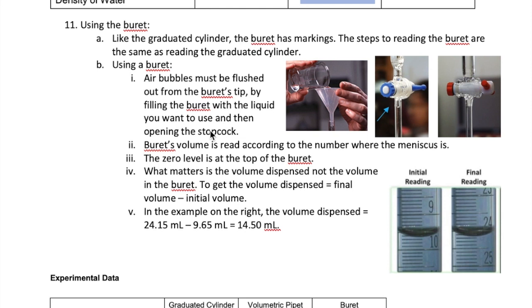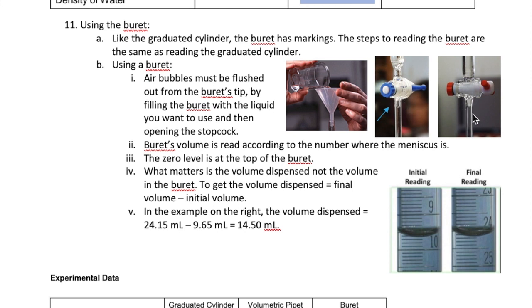A few things are important when using the burette. Fill it with liquid by pouring through a funnel inserted into the burette. Make sure the stopcock at the bottom is closed, otherwise liquid will stream out and you'll have a major leak. Typically when you first pour water in, you'll see an air bubble trapped at the tip of the burette. You won't be able to use the burette correctly until that bubble is removed. To flush it out, simply open the stopcock and let the flow of liquid push the air bubble out. Once the bubble clears the tip, you can read the volume correctly.